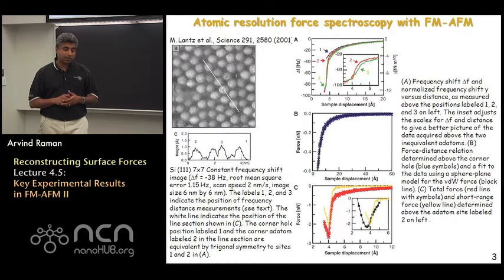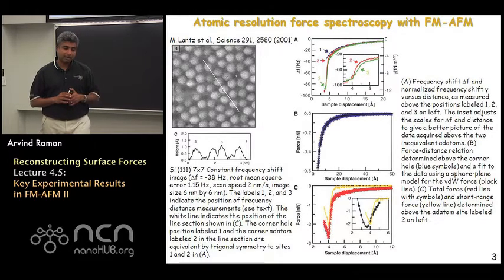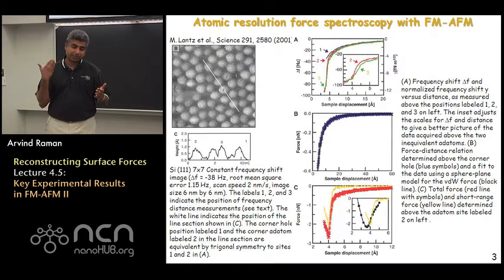What we will talk about today are the key milestones that have been achieved in force spectroscopy using FM-AFM. Remember, force spectroscopy is the process of trying to convert information on frequency shift and dissipation or excitation as a function of Z into F versus D, which tells us a lot about the local chemical structure of the atoms that one is intending to study.